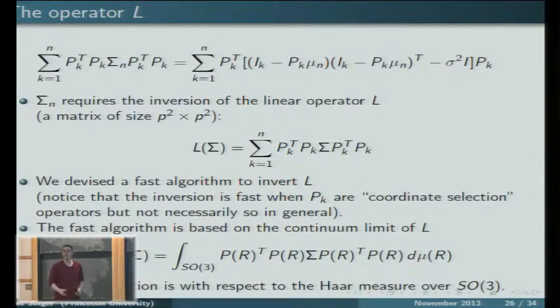This integral operator is just the counterpart of projection, back projection that you have in classical tomography. But now instead of operating on our original object, when we try just to reconstruct mean, now we have to reconstruct covariance.